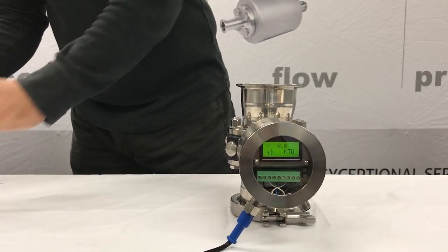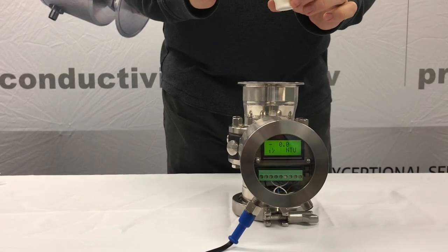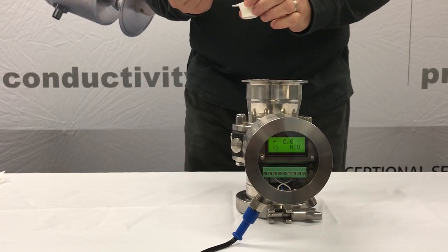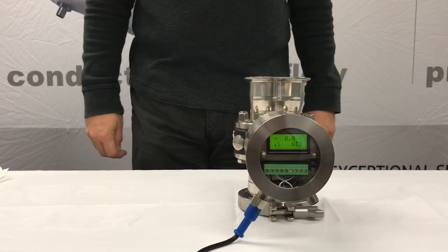And now I'm going to take a dairy creamer and introduce one simple droplet into this solution. And what you'll see is as that droplet drops through the water, the display should start to increase.